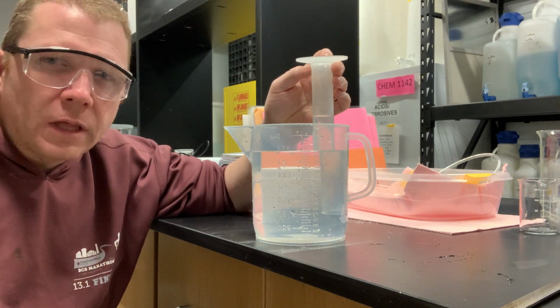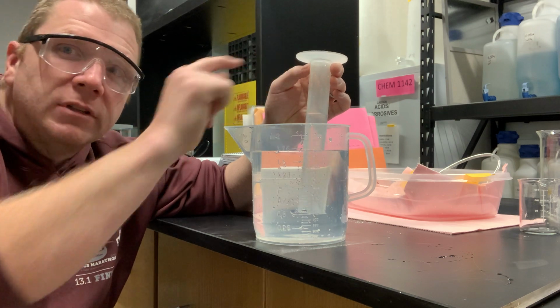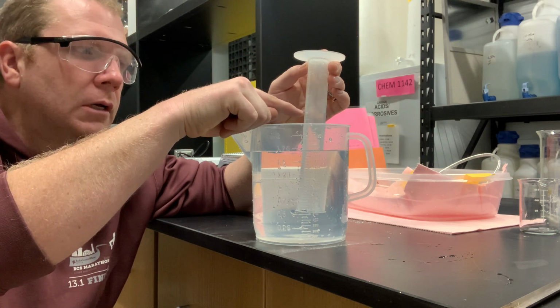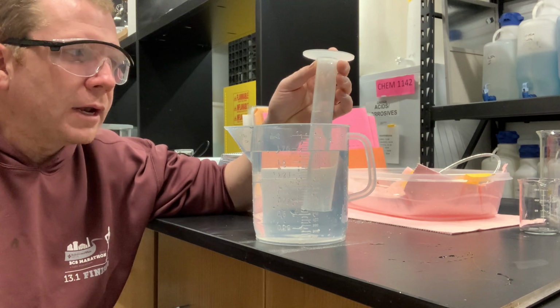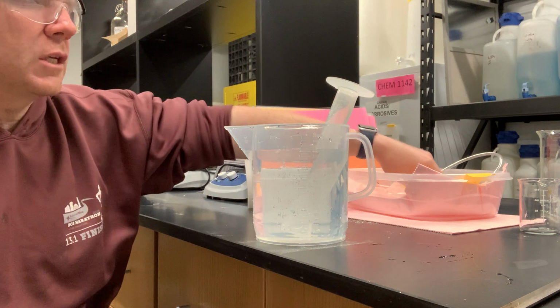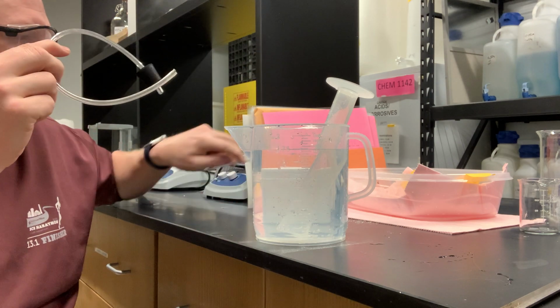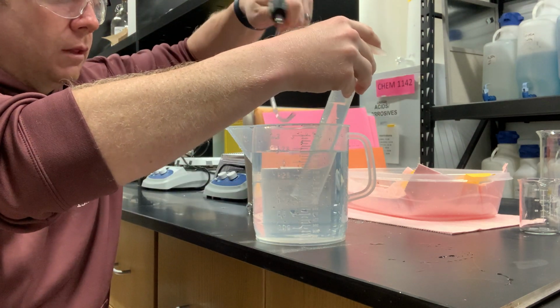Now, one thing that I'd like you to recognize about your grad cylinder is that as long as you have 10 milliliters of gas in here, you'll be able to observe any sort of change in volume of gas up to 100 milliliters. So now that I have this in place, I'm going to set it aside. But the next part of my procedure is to very carefully thread this tubing into the bottom of my grad cylinder. So I'll lift this up a little bit.